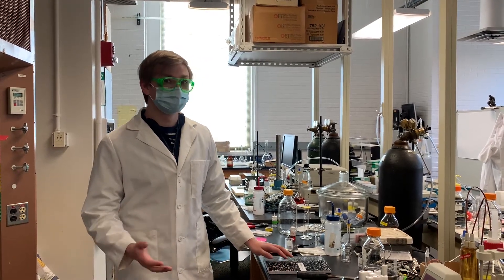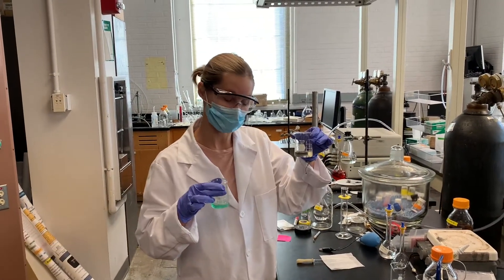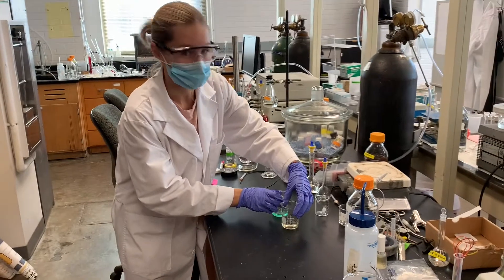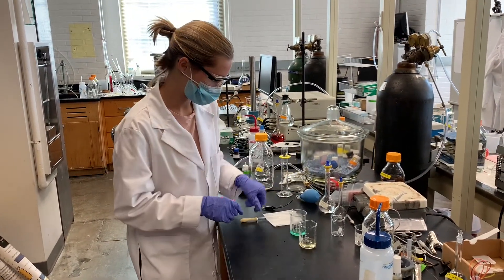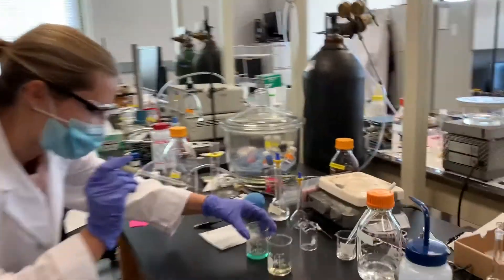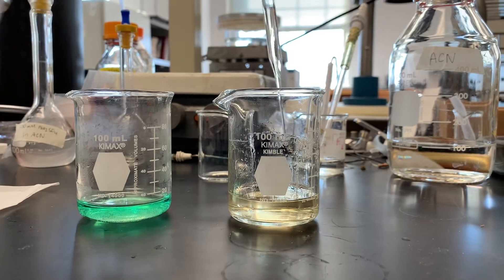Here we have our nickel chloride solution, and here we have our bippy solution. To make the complex between the two, we're going to add the bippy to the metal dropwise. The binding should be shown by a color change.